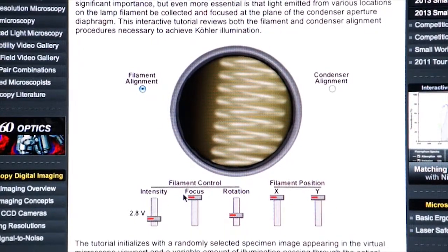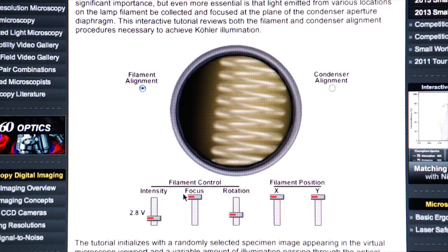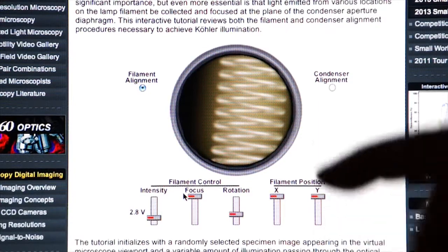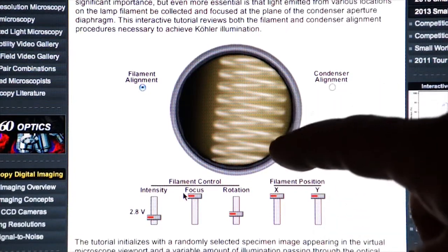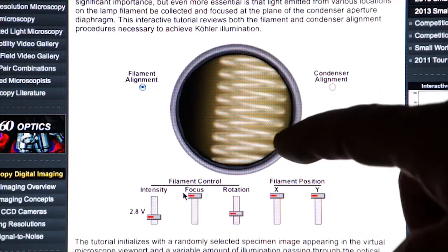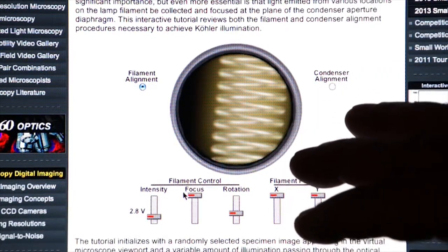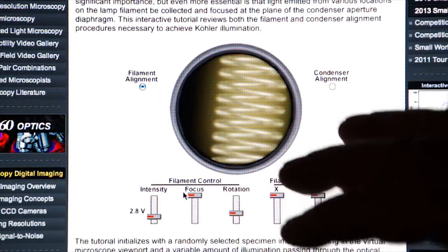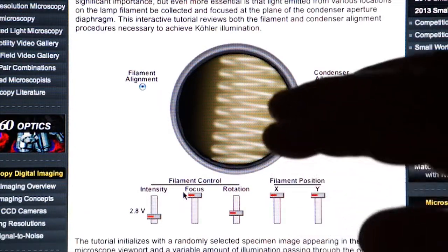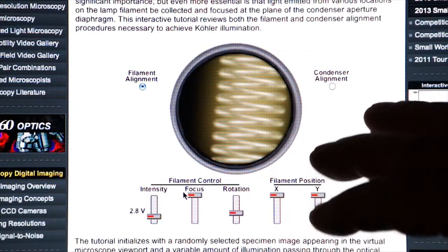In discussing Köhler illumination, it's important to understand how the lamp is affecting your image and how the condenser is centered to the optical path in the microscope.